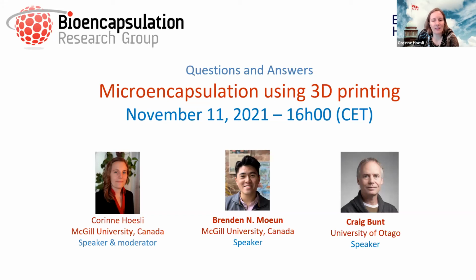Anand Patel is asking, when you add calcium salts to prepare your thixotropic alginates, how does that affect osmolarity and viability, Brenden? Yeah, so that's a really great point. I think when you're modifying hydrogels or any sort of aqueous solution, the osmolarity definitely has a role. And we've seen improperly handled solutions cause death to cells based on osmolarity. We have not looked at it in the research that we presented. However, this is something that we are very interested in looking at.